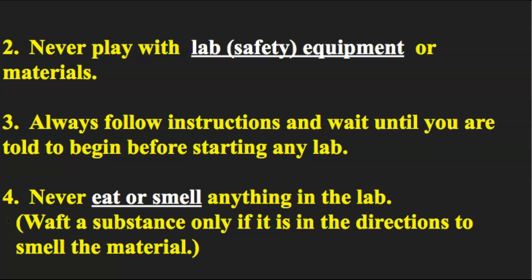Number 3 on our list of general safety information, always follow instructions and wait until you're told to begin before starting any lab. Don't just go back in the lab and start on things, even if you think you know what you're doing. There's always something that as teachers we need to tell you beforehand to make sure everyone's safe and how to dispose of supplies.